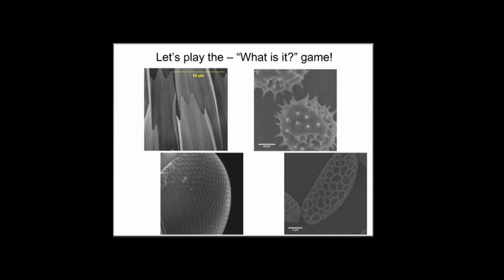So I think I'm going to go ahead and move forward, but I'll let you know, just in case you're wondering what the other two images are. On the upper left, we have a moth wing, and on the bottom left, we have an ant eye. And all of these were captured remotely.